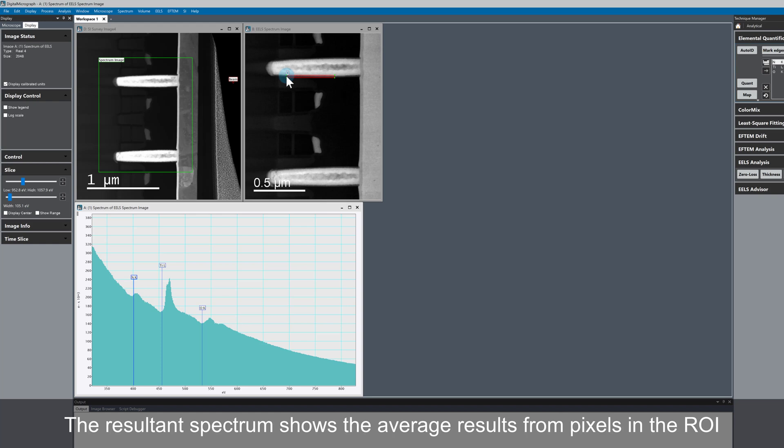We can see that we have here a nitrogen K edge, titanium L edge, and the oxygen K edge.